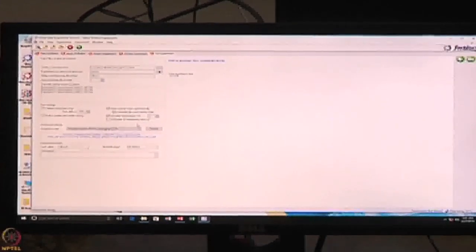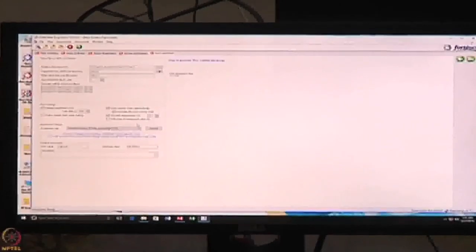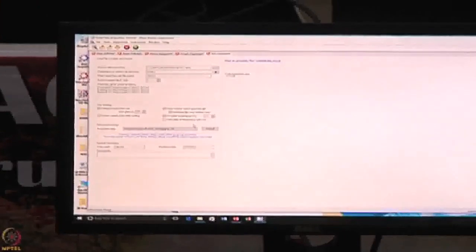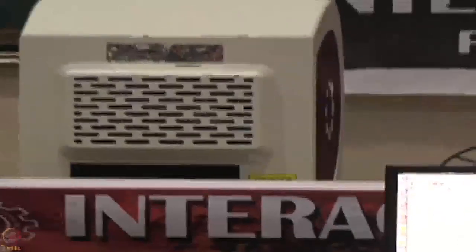Before going to that, we have to place the sensor as well as my sample tray in the instrument, right? So here is my sensor tray. These are the seven sensors I'm using. I'm placing them here. I will show you this once the experiment is done, you can look into that. I will place it here, and my sample plate.